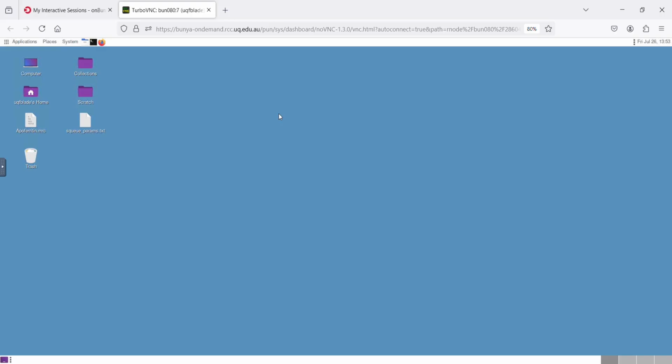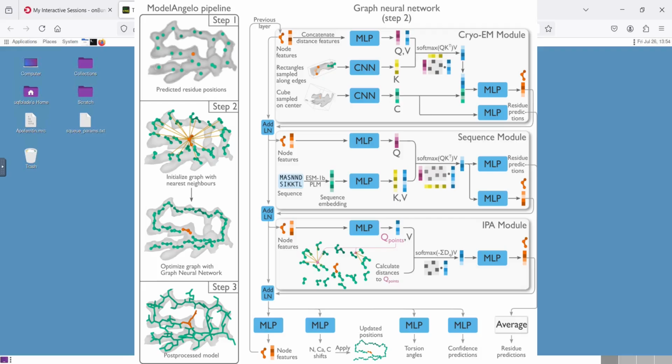Now, the traditional way of doing this is with Phenix and then refinement in Coot. But there's actually a different way to do this now, developed by Sjors Scheres's lab, and it's called ModelAngelo. ModelAngelo works kind of like AlphaFold, but it also considers your map on a voxel by voxel basis. So it's extremely powerful and utilizes what we already know about proteins and their structure. It's really straightforward to run, and I'm going to show you how to do it.